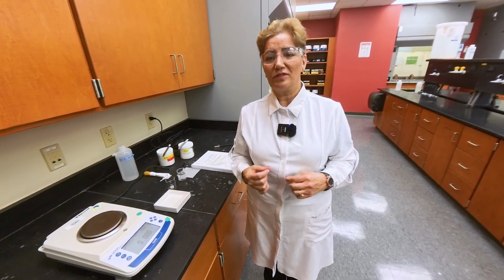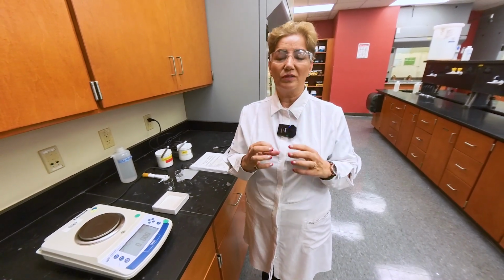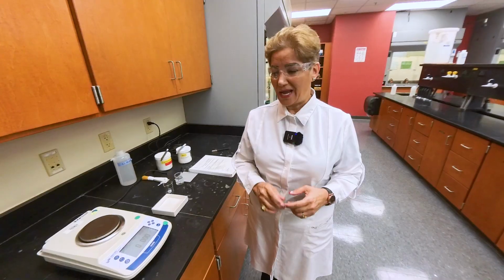That is your lab coat. You must have your lab coat on whenever you are in the lab, and your safety glasses, your goggles. You must have long pants, closed-toed shoes. Those are required for the lab.